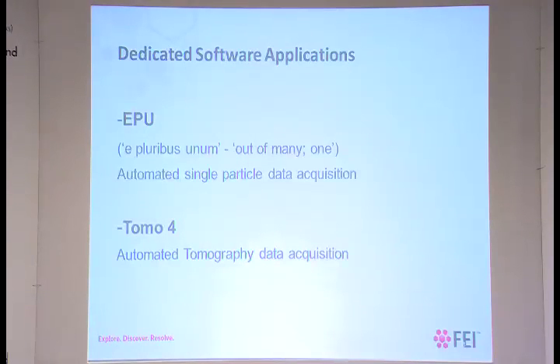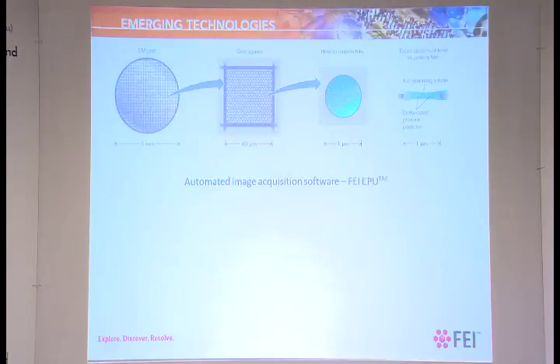So what are our dedicated software applications? Okay, so we have EPU, and this is our automated single particle data acquisition program. It means "out of many, one." And then we have TOMO4, which is used for our automated tomography data acquisition, which is also very automated.